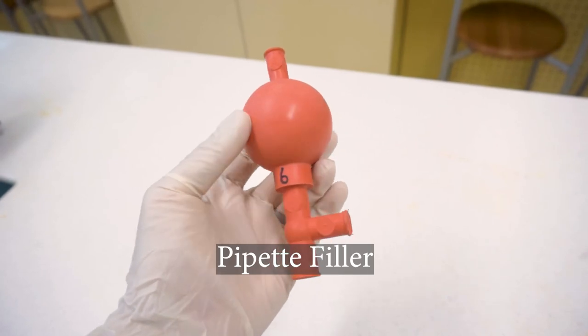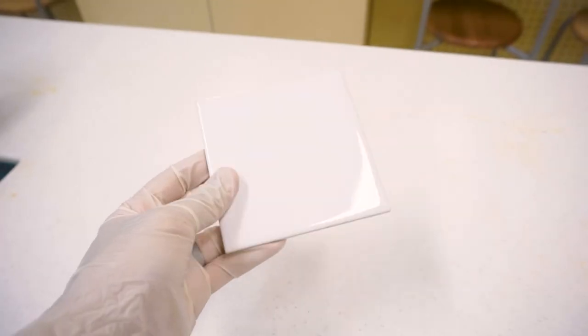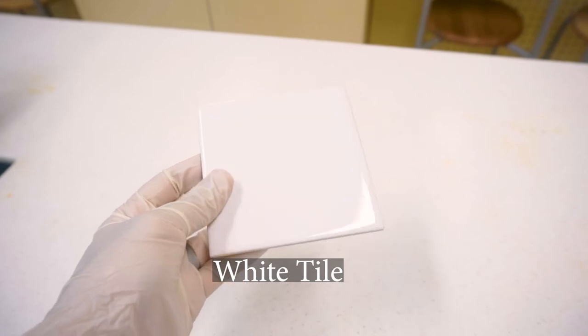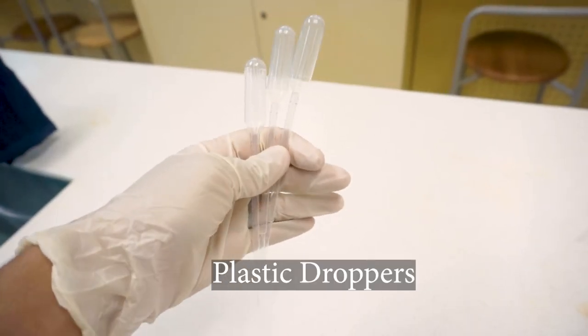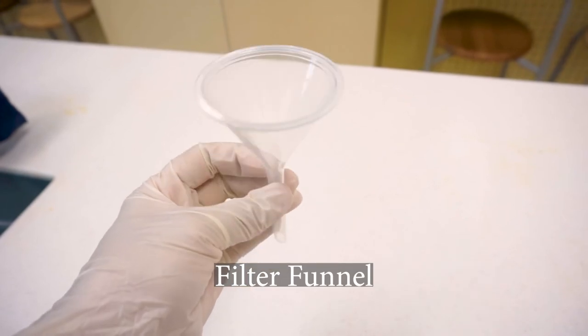A pipette filler, a white tile, a few plastic droppers, a plastic filter funnel.